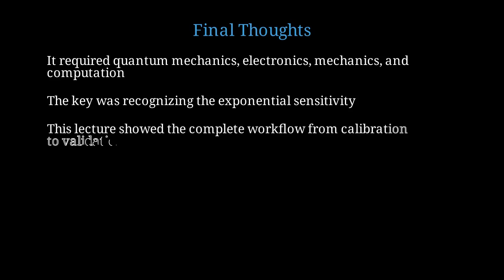In this lecture, we walk through the complete experimental workflow: tip calibration, vibration isolation, current distance characterization, reference surface imaging, theoretical modeling of the local density of states, and validation through bias-dependent measurements. Each step builds confidence that we truly understand what we're measuring at the atomic scale.